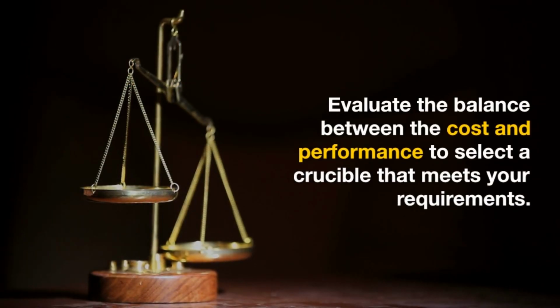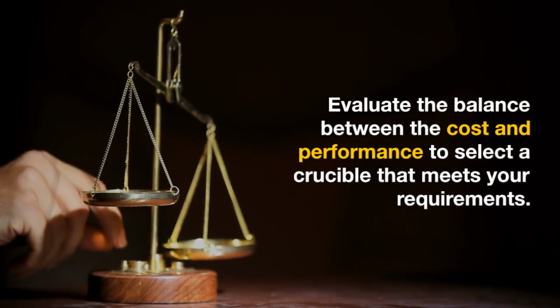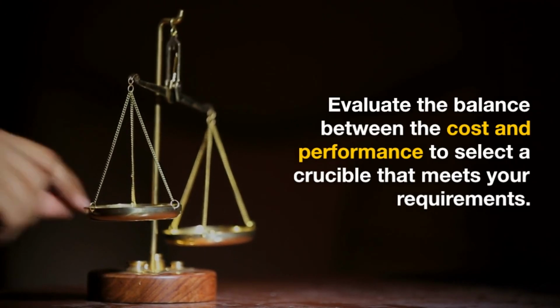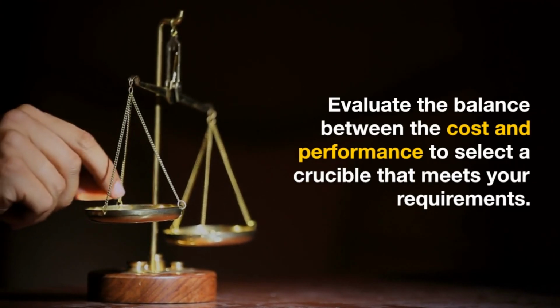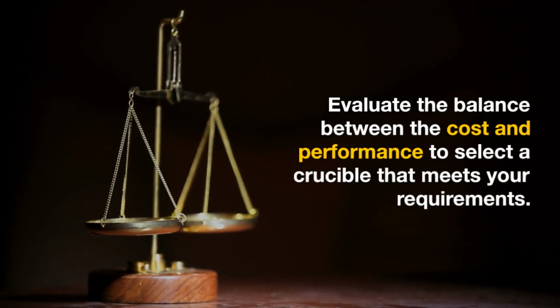The cost of the crucible is an important factor to consider, especially when working on a budget. Different crucible materials come at varying price points. Evaluate the balance between cost and performance to select a crucible that meets your experimental requirements without exceeding your budget.